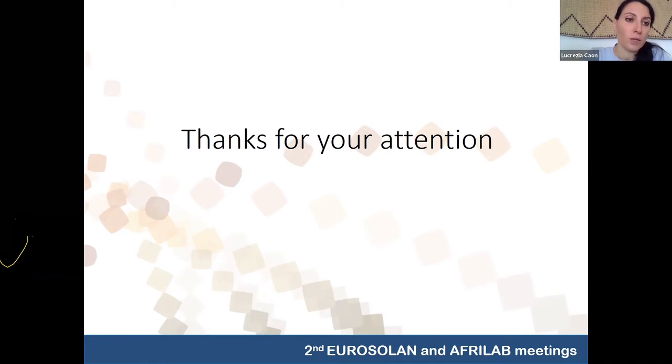Already through the assessment, we aim to ensure that we don't give equipment to any laboratory that they cannot operate or that they don't really use, because we also ask about the number of samples that they analyze each year. So what type of analysis you do and how many samples you analyze every year. For example, if you ask me for equipment to do nitrogen analysis, but it turns out you do this type of analysis on 50 or 100 samples per year, I would not make the investment. The investment should be justified.